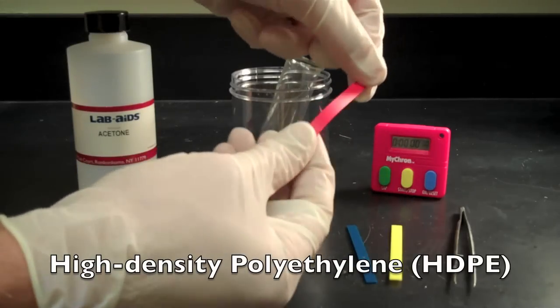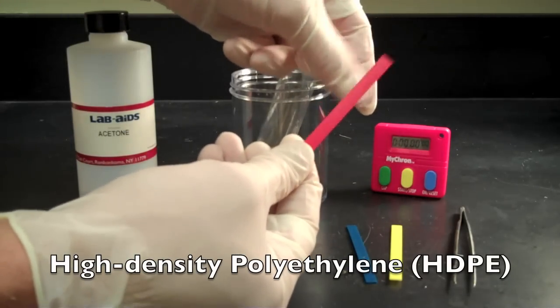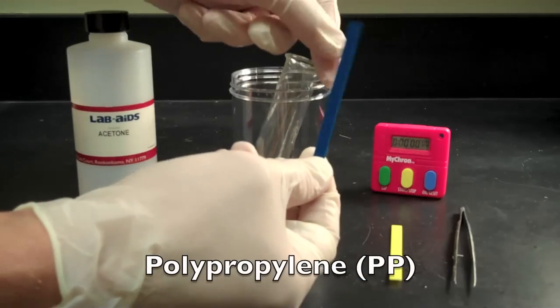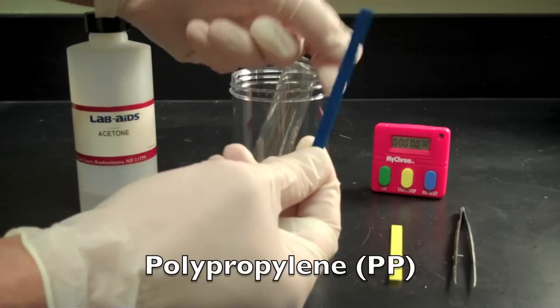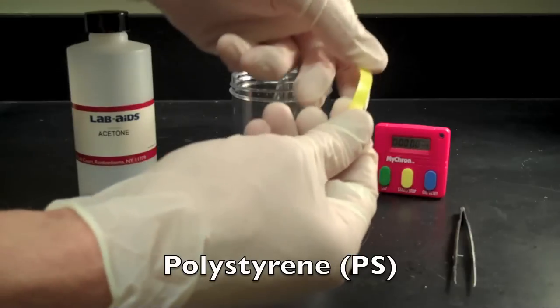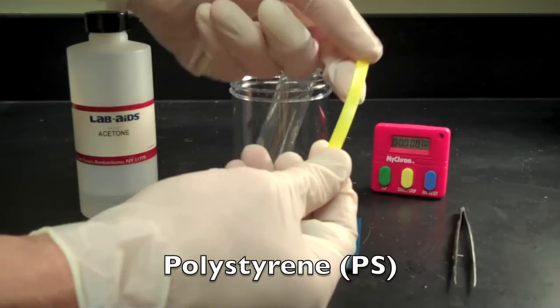The red strip is high-density polyethylene. It's fairly flexible. The blue strip is polypropylene. As you can see, it too is fairly flexible. And finally, the yellow strip is polystyrene. It's very stiff.